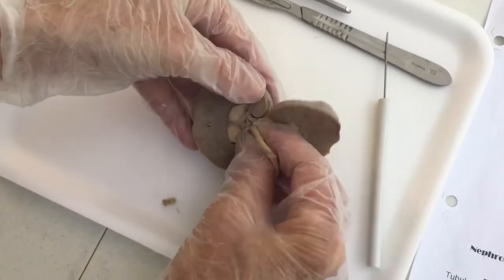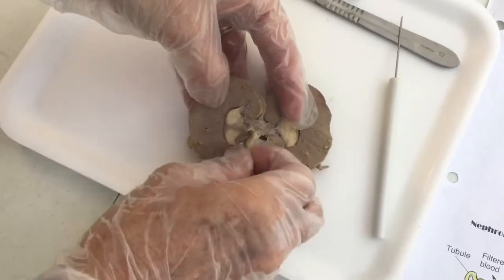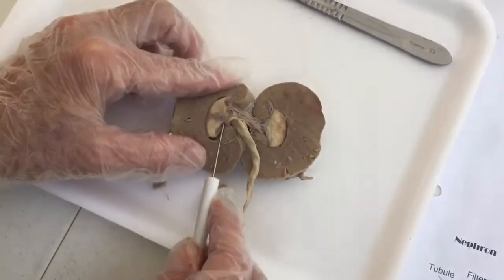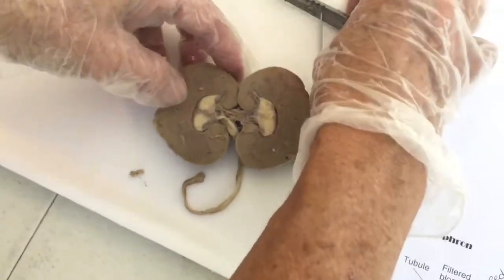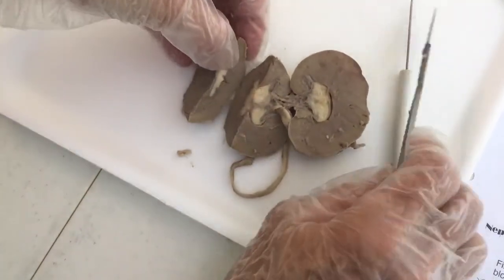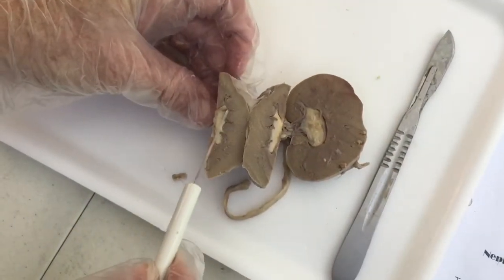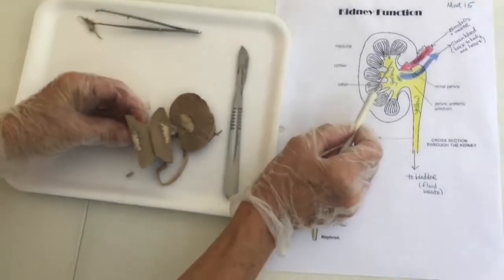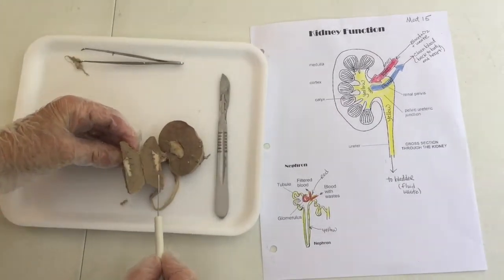All right, so you can see how this ureter is actually directly linked to this renal pelvis. This is that same color. You can see how that's all here. If you have a kidney, you're welcome to go ahead and pull apart some things and look at it. Let's take a look a little closer. Let's see what happens if I cut it this way. Right, so you're just seeing how thick it is. You can see a little bit more of where all those nephrons would be. That would be like our picture we saw. Look over here, it went out, and you see all these peaks. This is where you're seeing it here, the same on the kidney.